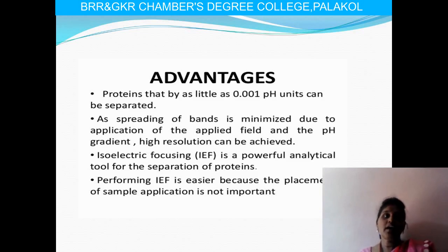high resolution can be achieved. So isoelectric focusing is a powerful method specifically for the separation of proteins, and we can use it to separate the serum proteins into 6 different bands. Performing IEF is also easier because the placement of the sample application is not important.